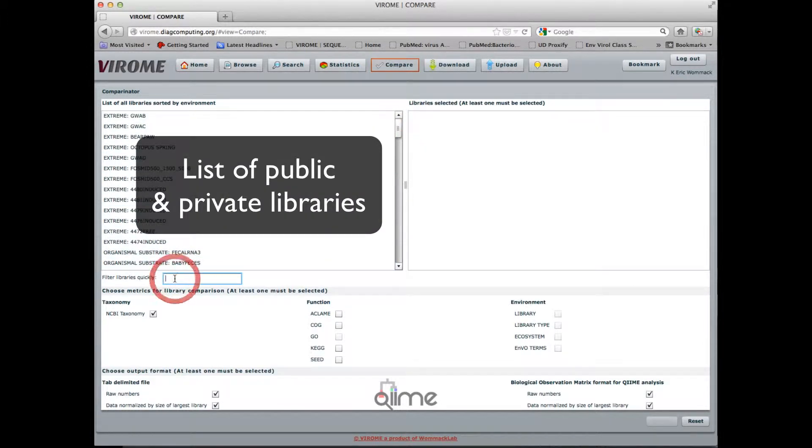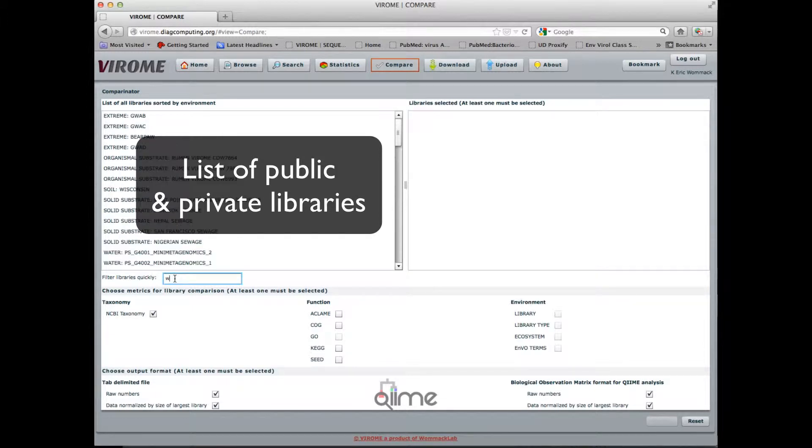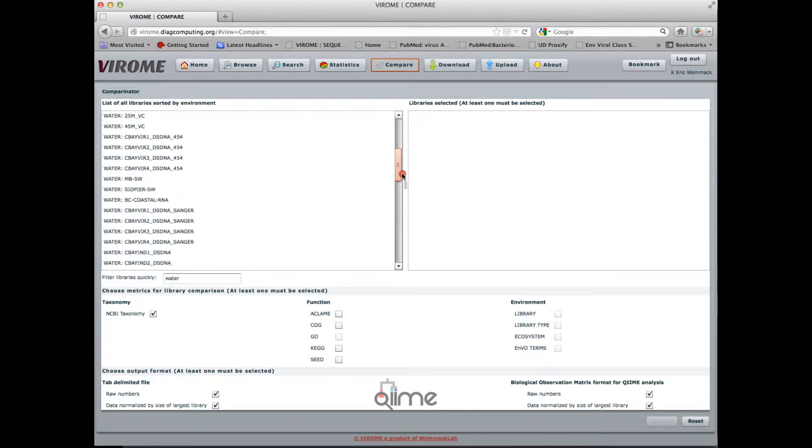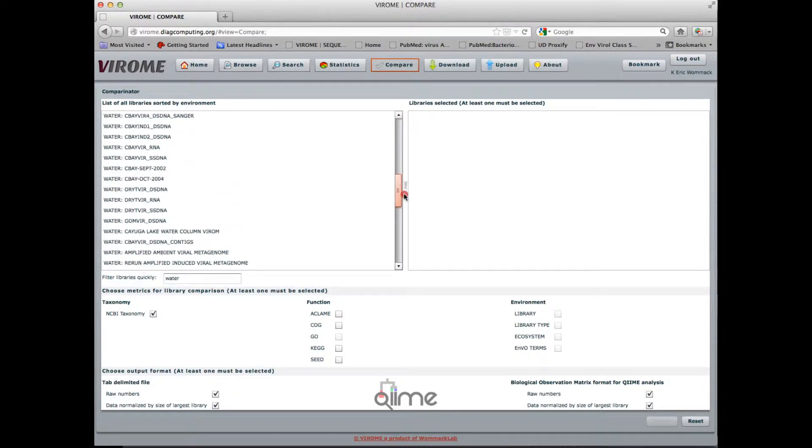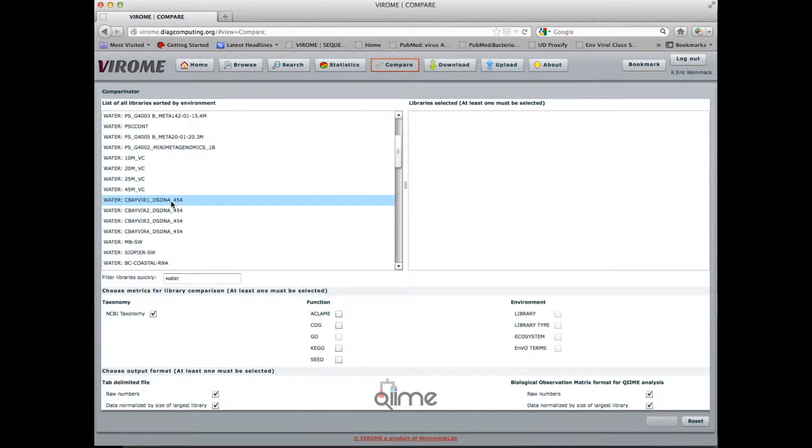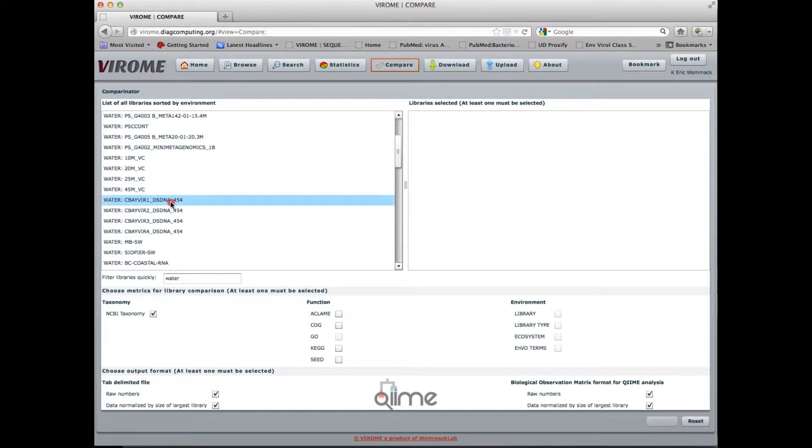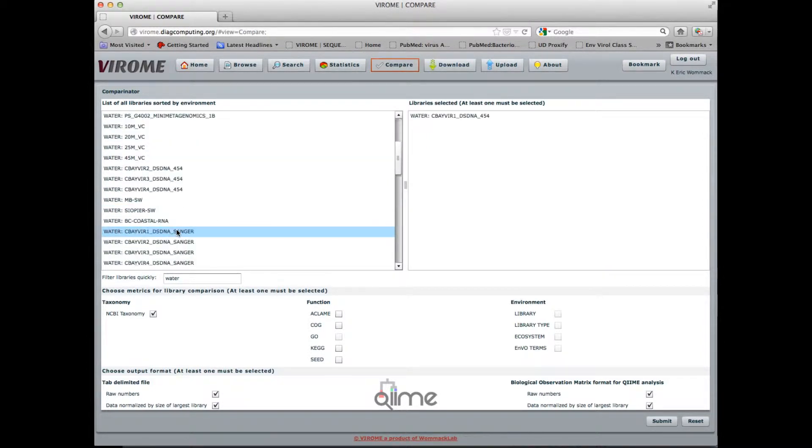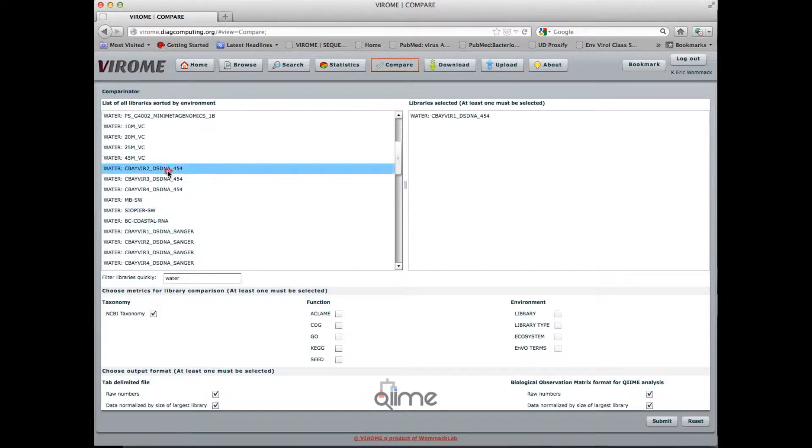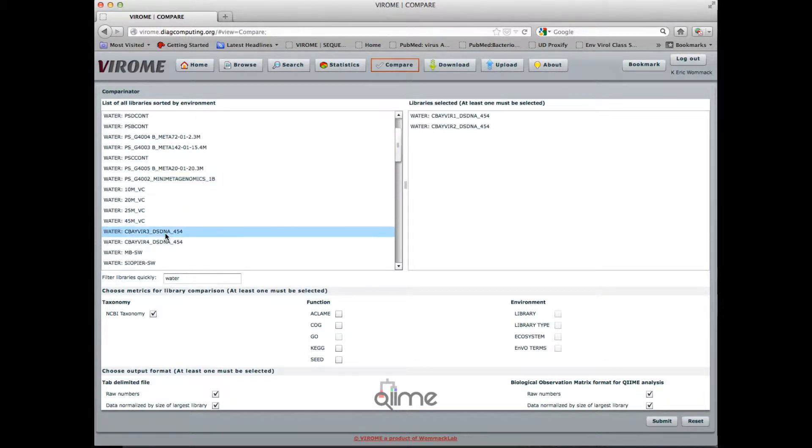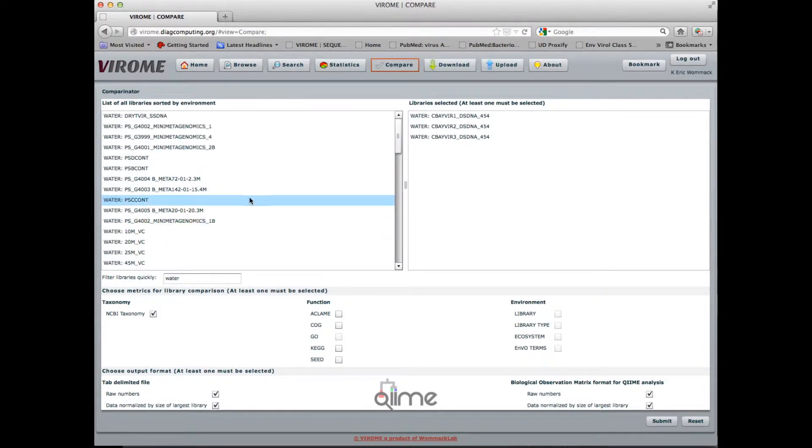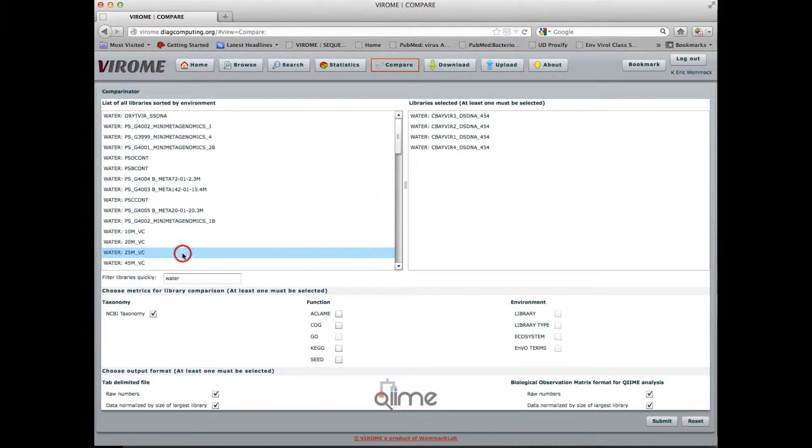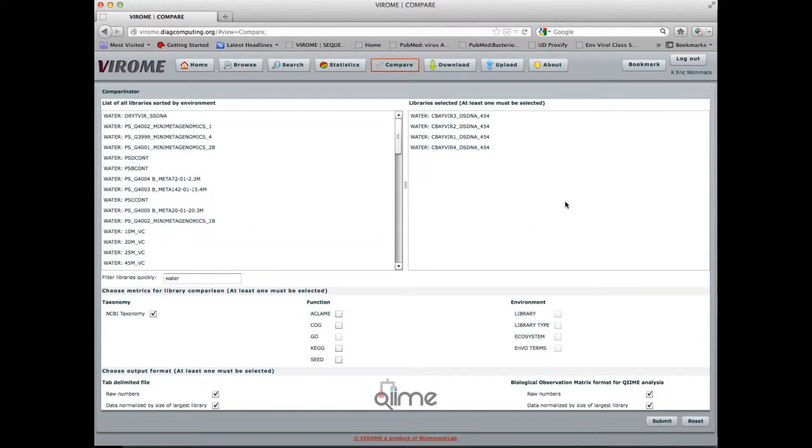Using this dialog box we can filter the libraries to just those that are in water, and I'm going to choose these four libraries to compare. Double click on the library name, and that puts them into the window, the panel on the right-hand side.